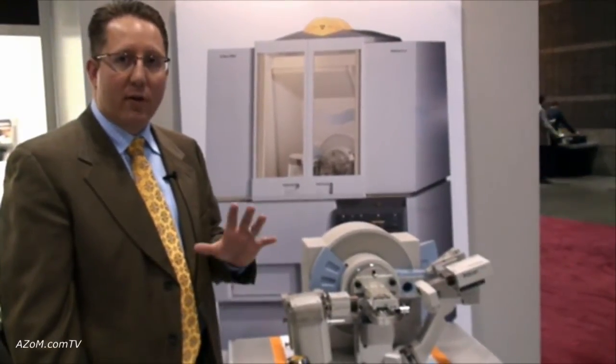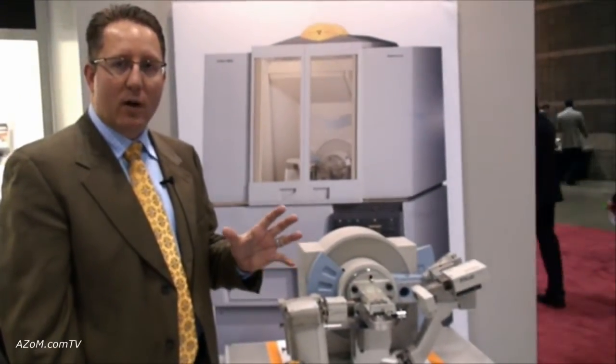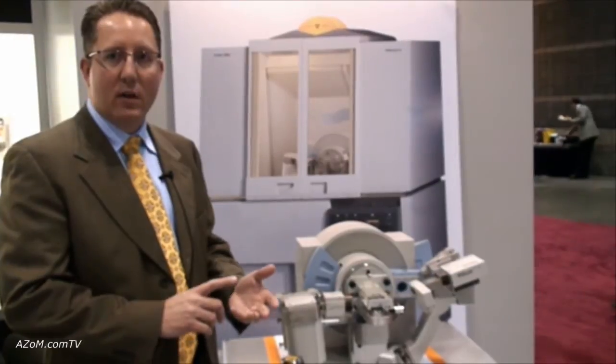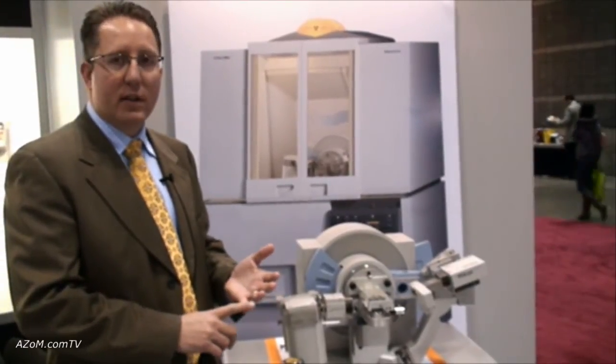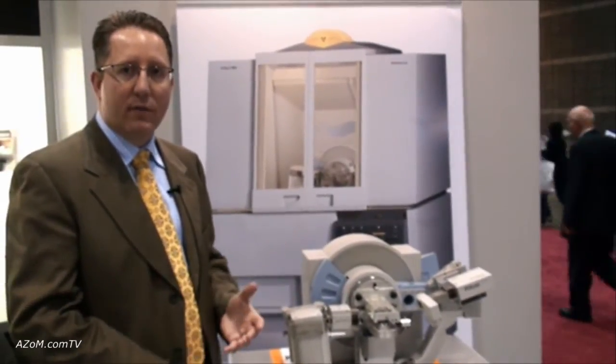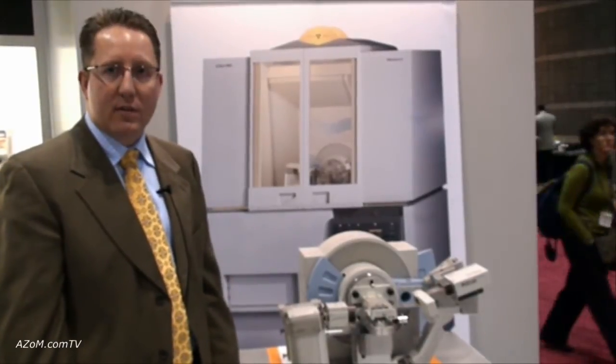And Brian, where are these instruments typically used? Typically throughout all different industry segments such as catalyst, pharmaceutical, semiconductor, universities, basically throughout all kinds of materials analysis segments.